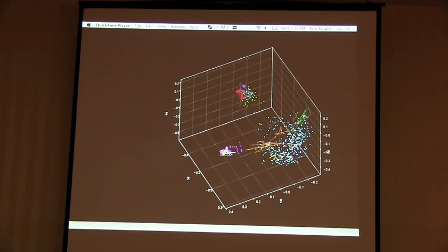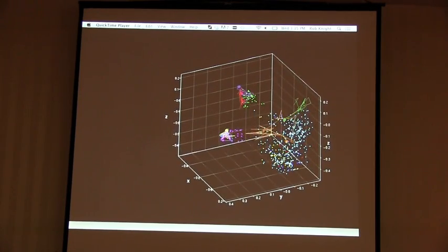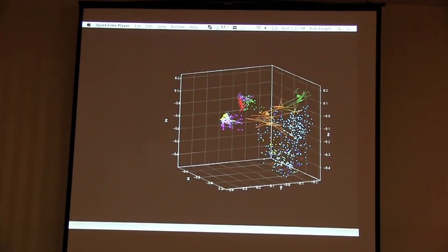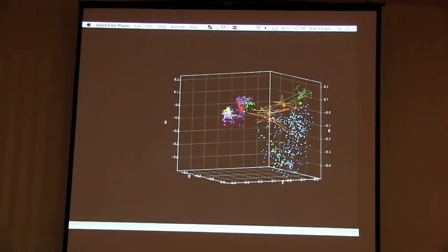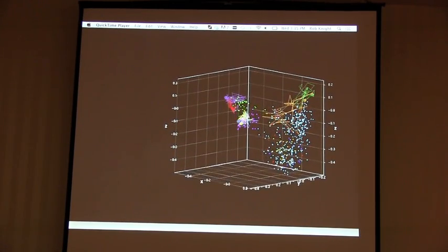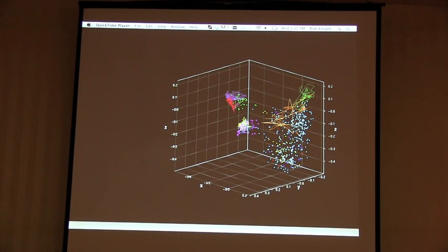You can also see how the individuals preserve their identity, despite the fact that they cohabit and have all kinds of opportunities to exchange microbes. And you can also see how valuable this kind of visualization technique is going to be for things like the built environment, where you do a very detailed time course, and you see how the building changes over the course of the day or over seasonal variation and so forth. And I should also mention that to do this, which was one of our first large-scale Illumina sequencing efforts, Greg and others in the group had to do a huge number of changes to QIIME in order to be able to process the much larger data sets that we were now getting.